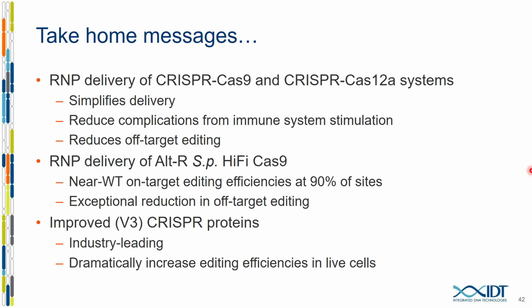We have a question asking if we have tested the immune cell activation with RNP. You show at the beginning the activation with IVTs, but we haven't seen any increased activity when using RNP at all with immune cell activation, I think is what this question is getting at.